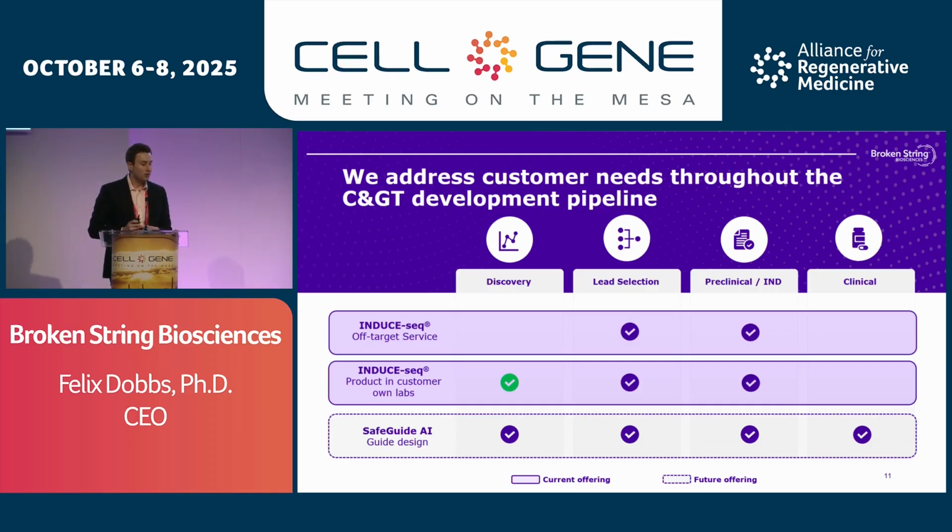The last line on this slide I just want to talk to briefly is that we have aspirations to go beyond simply measuring these sites and revealing where they are, and move into the design phase, where we want to bring a data-driven approach to the design of these guides and use our extremely clean INDUCE-seq data to better predict how the guide RNAs we're designing might induce sites, and essentially build safety into the design up front, which is something that typically is only addressed much later in the process.